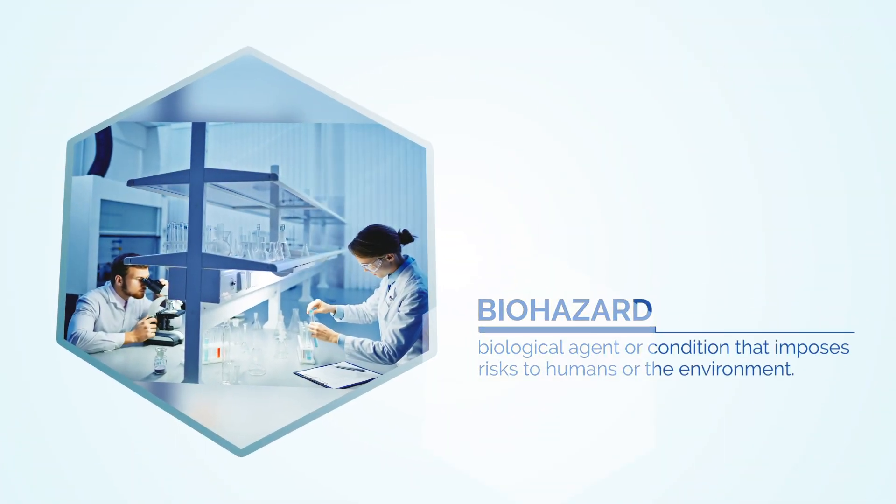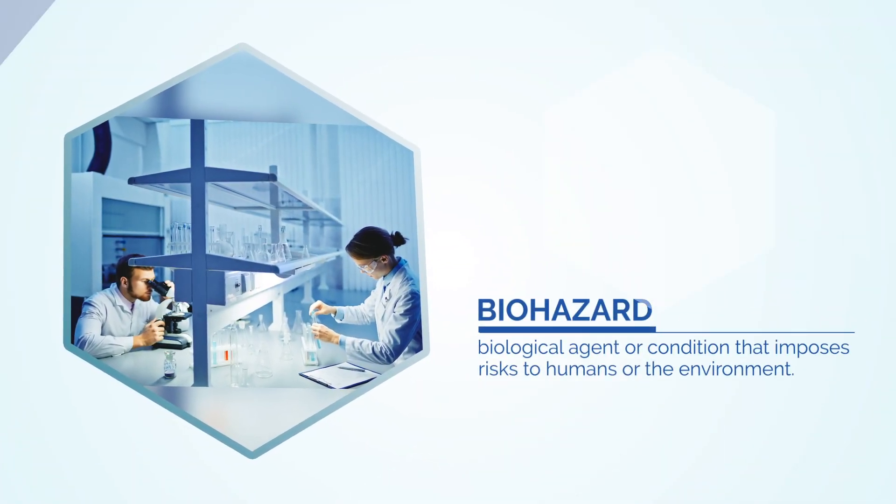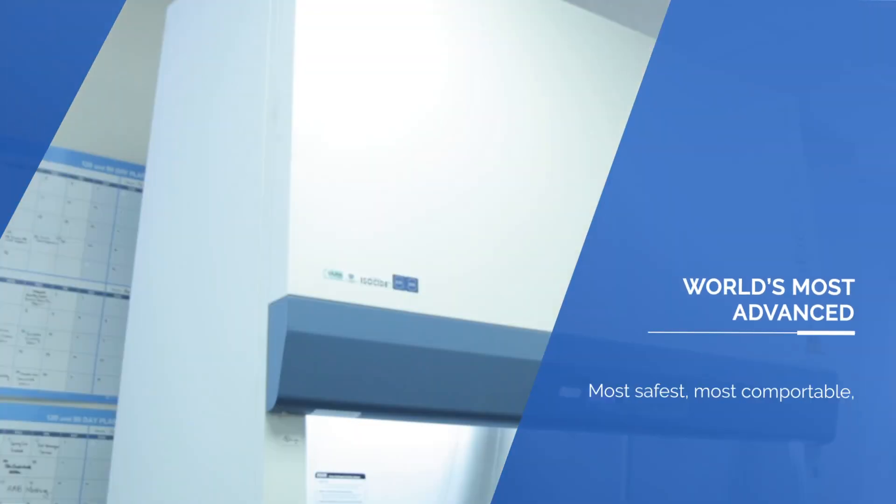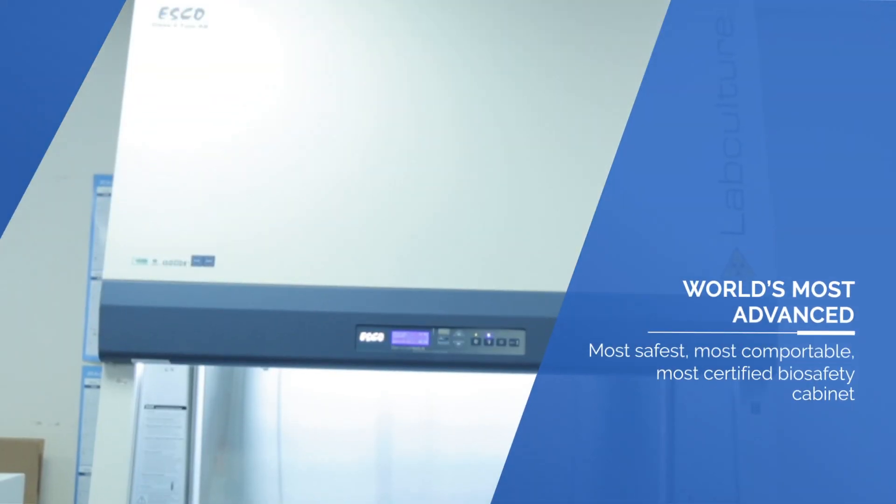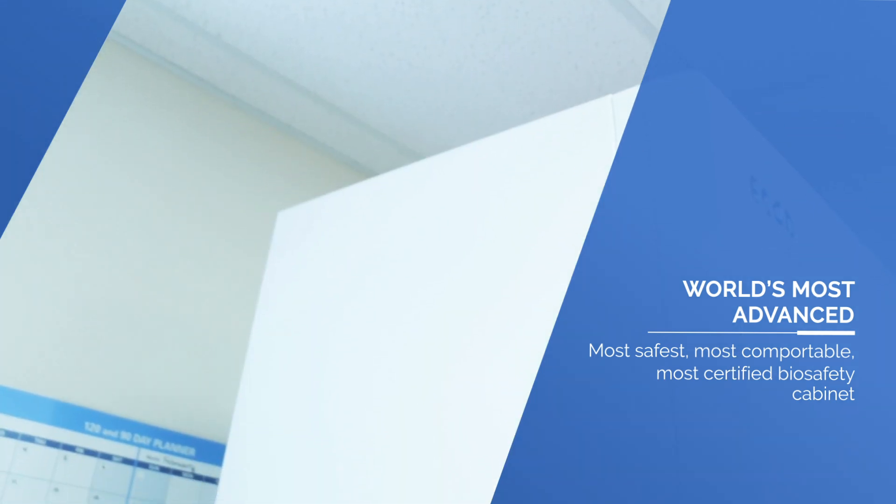Biohazards need effective handling to prevent causing harm. As your trusted partner in promoting safety, ESCO introduces the world's safest, most comfortable, and most certified biosafety cabinet.